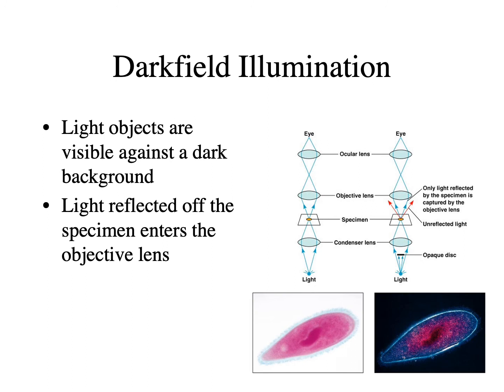If you look at a dark field microscope, it's the exact opposite. Only the light that hits the specimen is going to enter your eye. So it's like a bright glowing organism against a perfectly black backdrop.